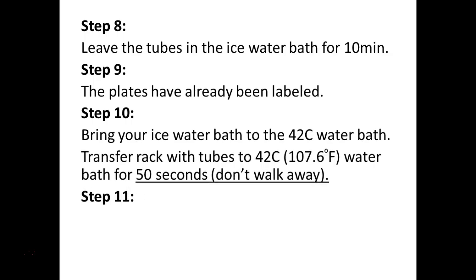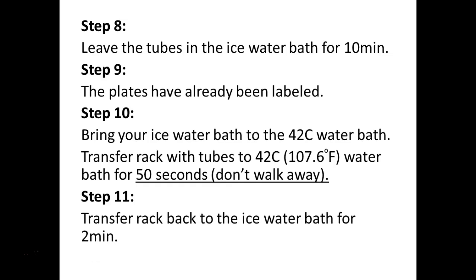You're going to transfer the rack, and you'll also notice on the white racks themselves there's a number, so that you can remember that that's your group's rack. If all of you are back there at the same time, you know that that's your rack, so make sure that you take a look at that. Do not walk away. You're only going to put it in there for 50 seconds. So time that, take it out, put it right back on your ice, and then transfer it back to your lab bench, and it's going to sit on the ice for 2 minutes.